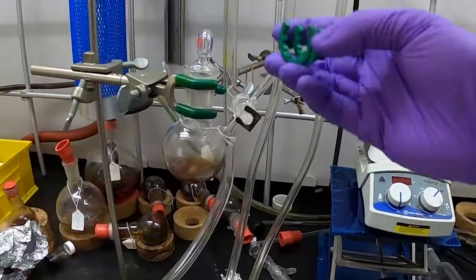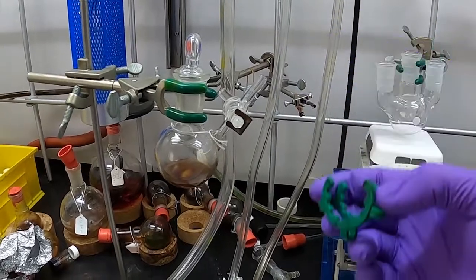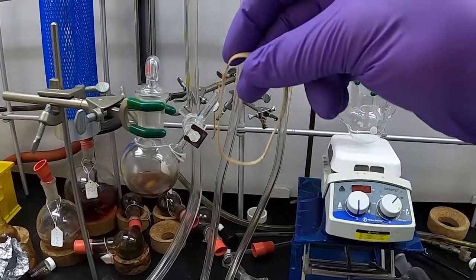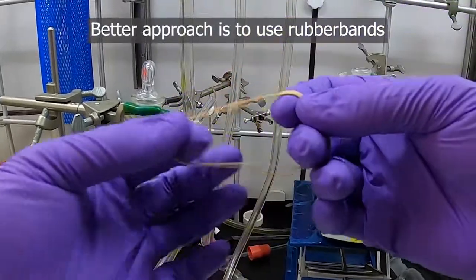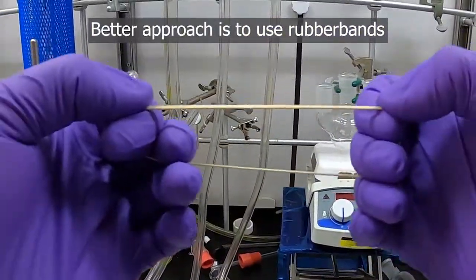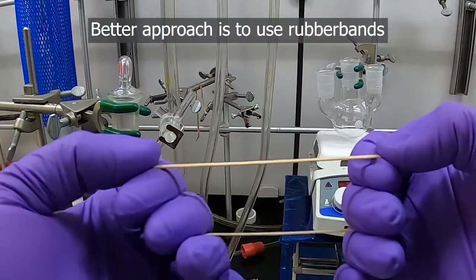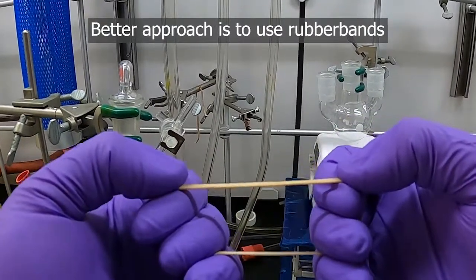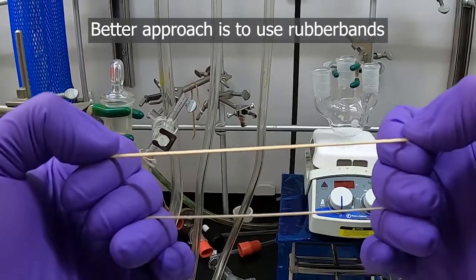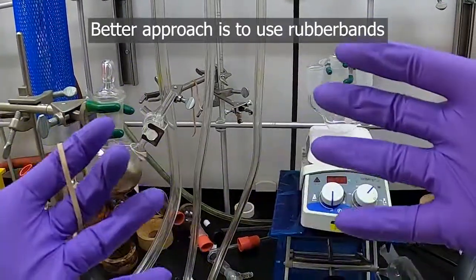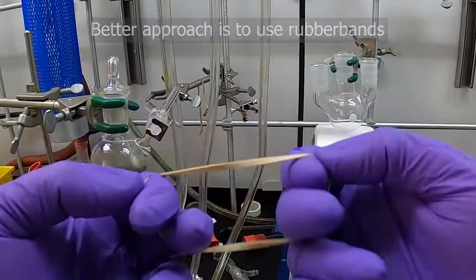A better approach is to use rubber bands. The case with rubber bands is when you see them, they stretch, and that's really useful when using Schlenk lines. What will happen is as you start to build up pressure, the rubber bands will stretch, causing the respective joint to open up, release the pressure, and then seal back up as the rubber bands pull it together.